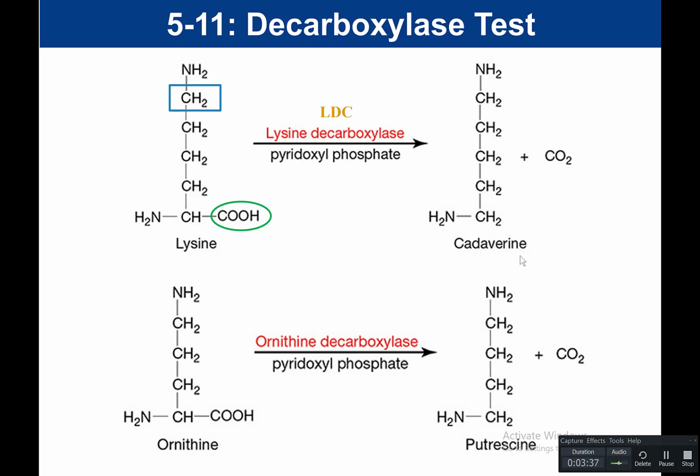Now, cadaverine, what does that make you think of when you see cadaverine? And the answer is cadavers or dead bodies, right? And so this diamine has a very putrid smell. If you think about dead bodies and rotting and the smell that they give off from these diamines, think about why that is.